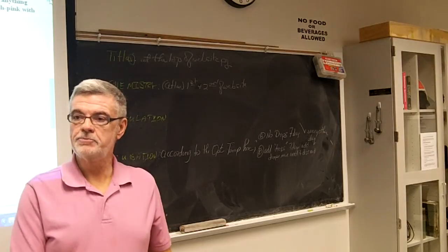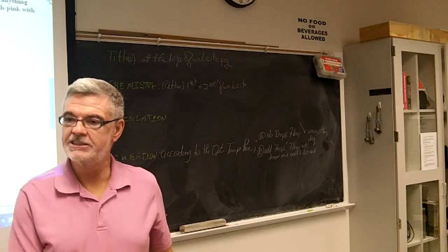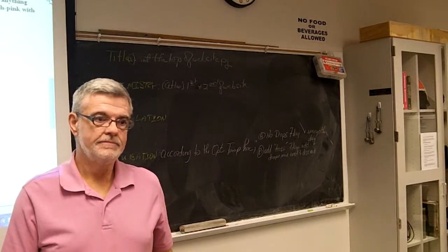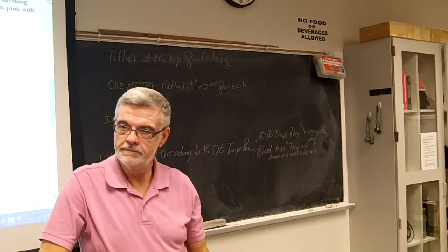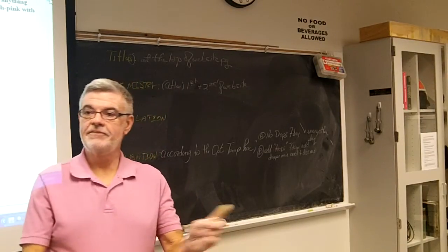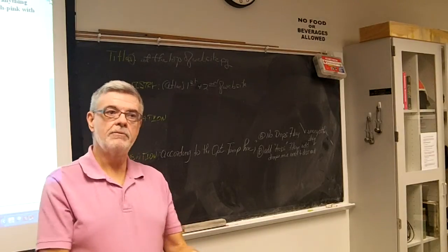So it'll say, litmus milk, don't run it. It changes color. You don't add any drops. So please don't run it for 7 days. It smells terrible. Read it after 48 hours. And the urea, it says, reverts after 48 hours. If you revert, what does that mean? Goes backwards. So it will turn positive, and if you leave it in there more than 48 hours, it will go back negative.